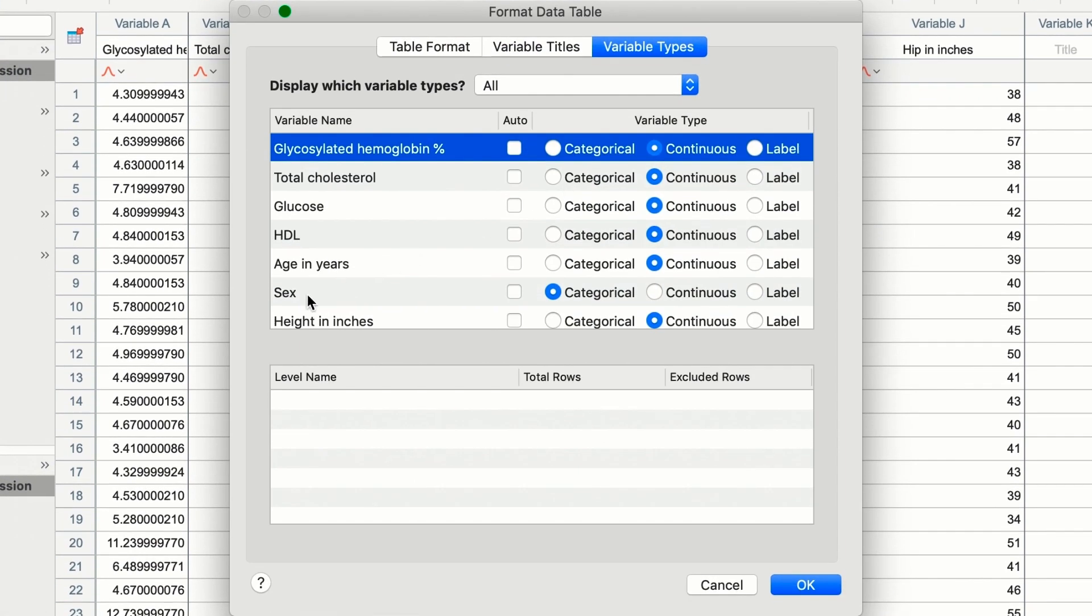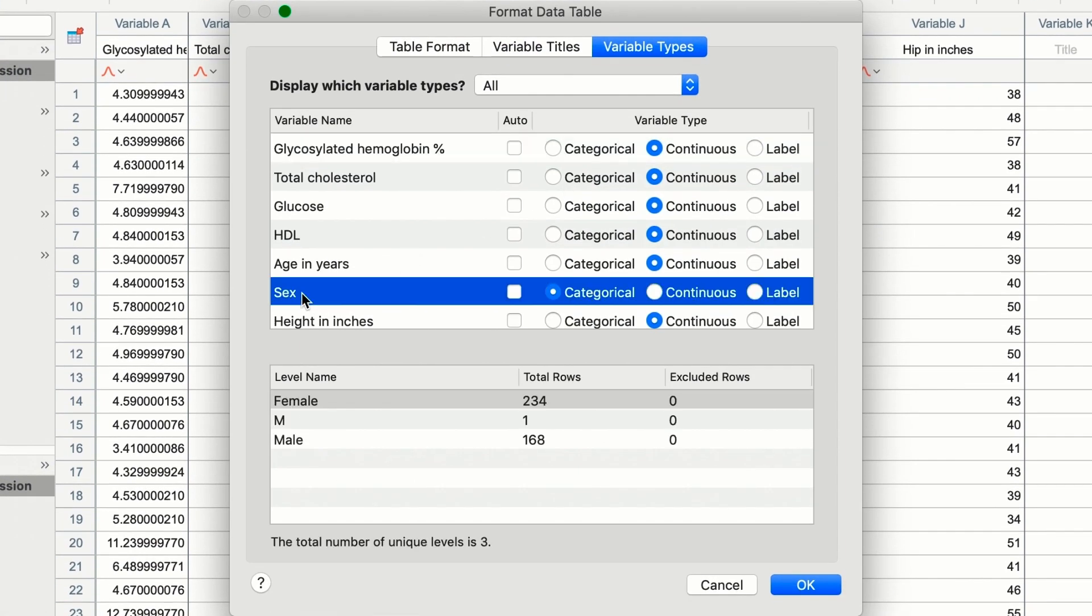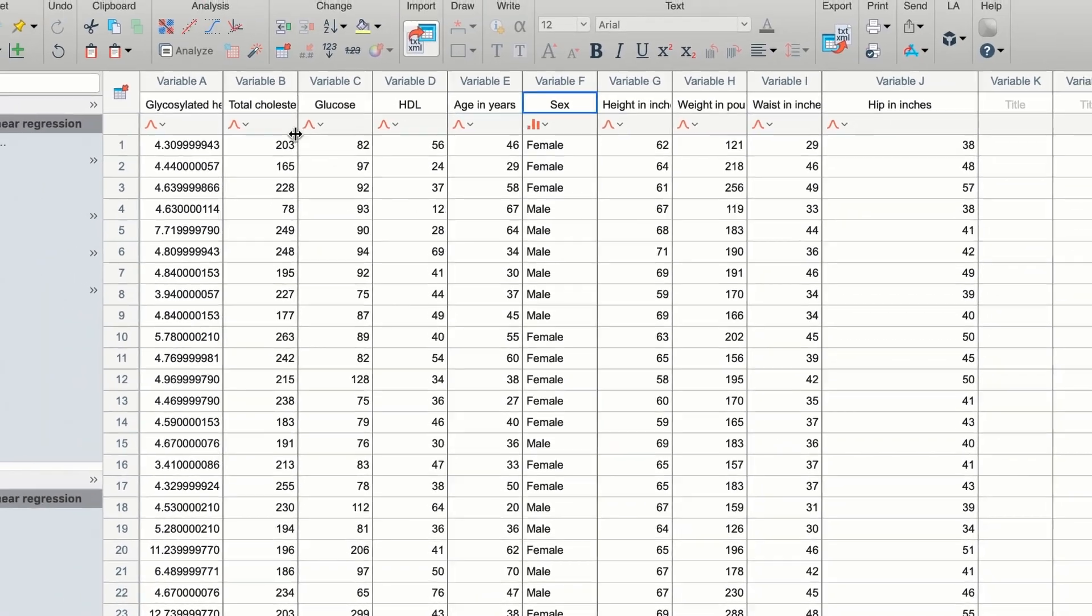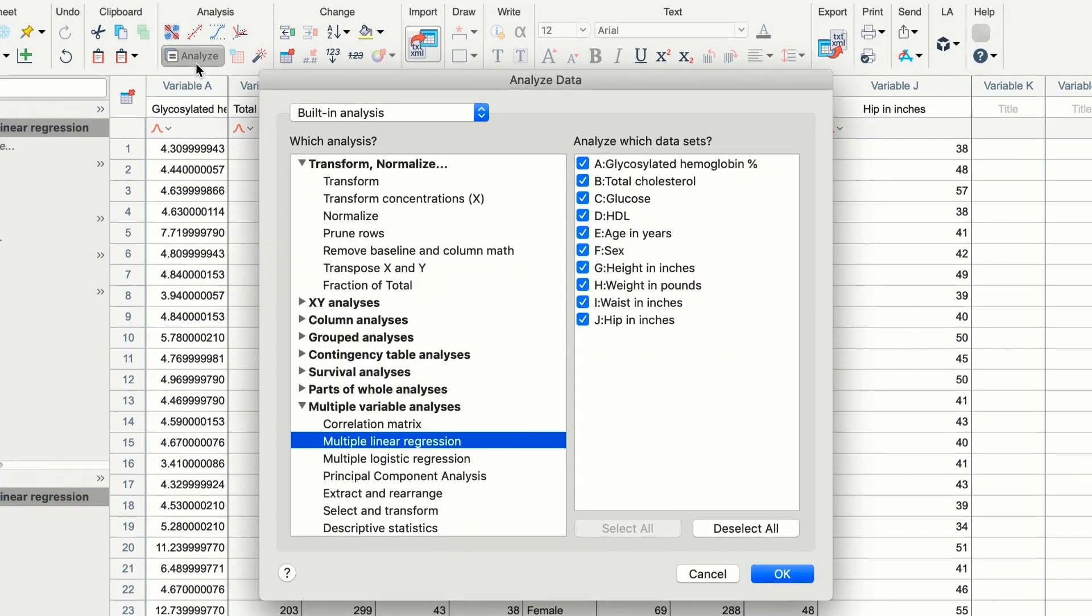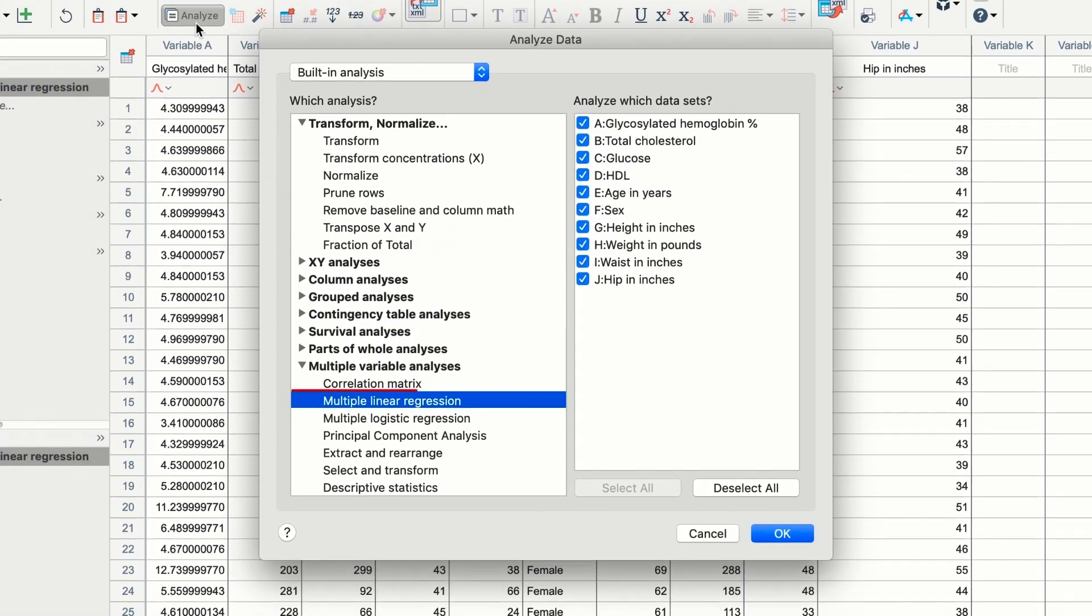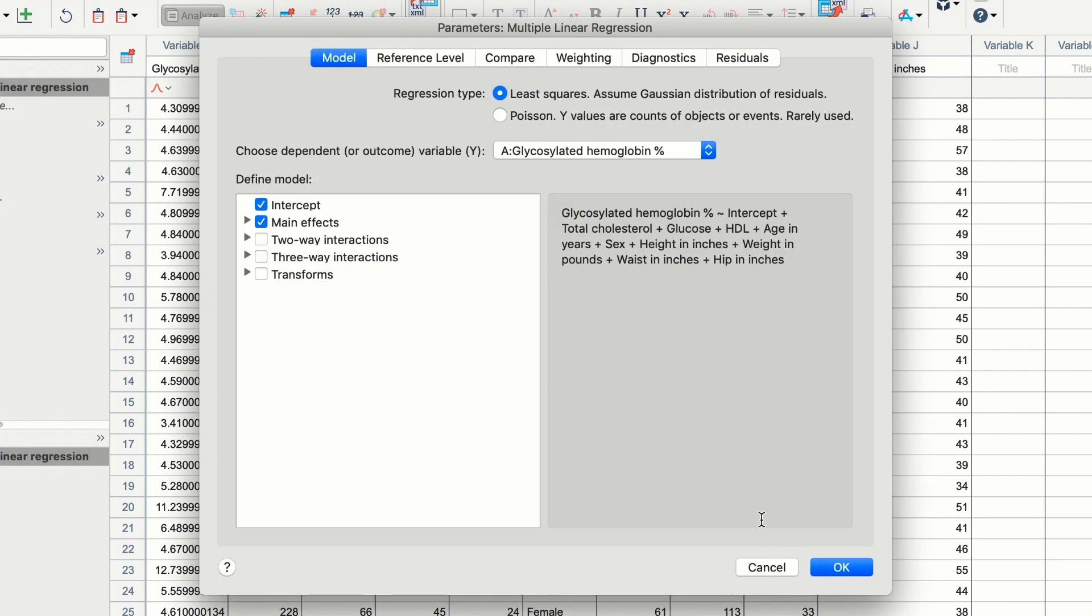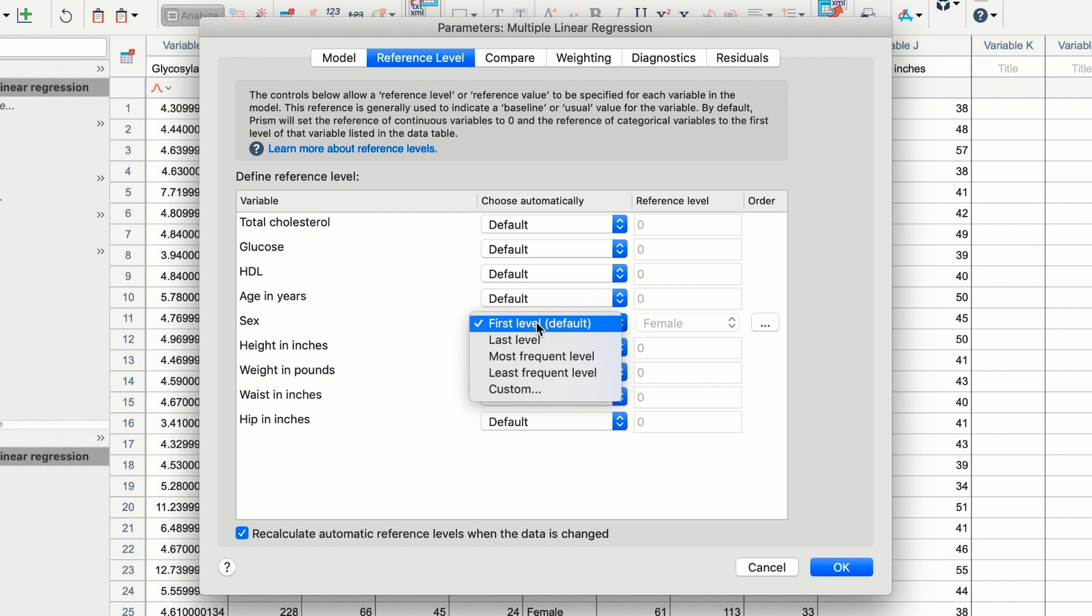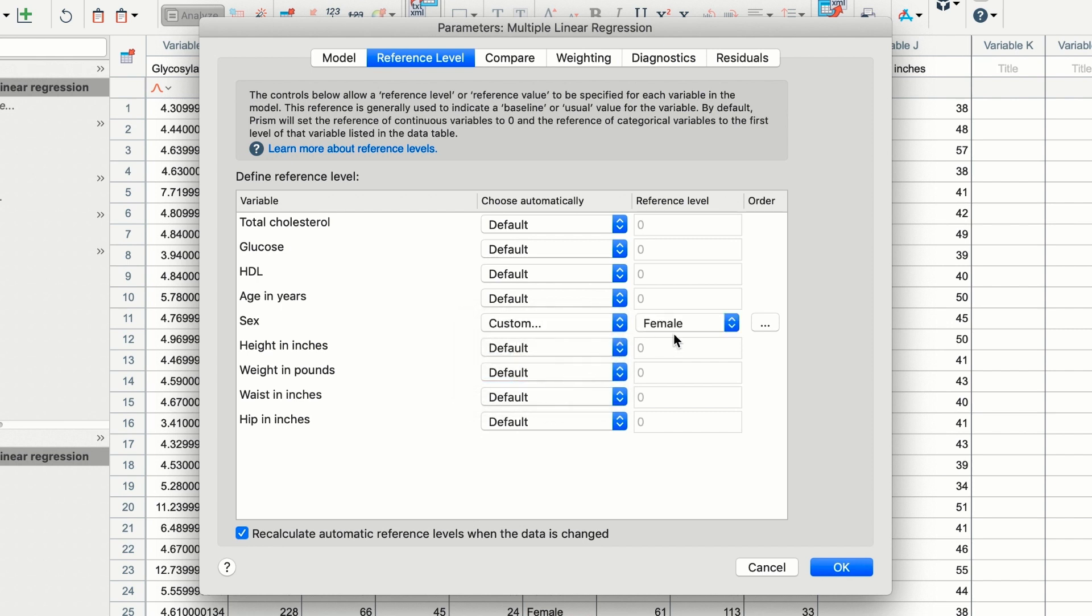And identifying typos or inconsistent entries for a category is easy to spot and fix. If you are performing a multiple regression or multiple logistic regression analysis, Prism will automatically encode categorical text predictor variables into numeric dummy variables when performing the analysis, and you have complete control over defining the reference levels.